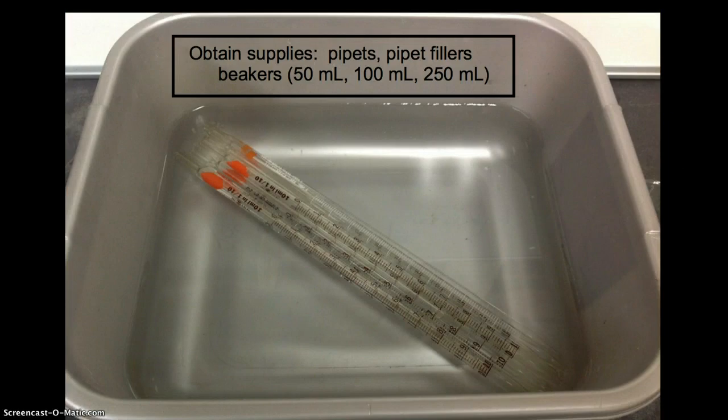The first step to this experiment is to obtain your supplies. You will need pipettes, which are the glass tubes pictured below, pipette fillers, which are green, and 3 beakers: a 50 milliliter beaker, which you should use to transport the sugar solutions to and from your lab bench, a 100 milliliter beaker, which you will use to make all measurements on the balance, and a 250 milliliter beaker, which will be used to contain your waste during the experiment.